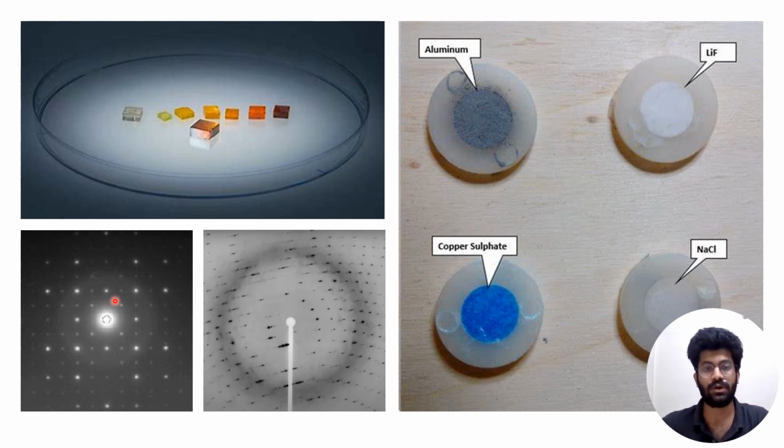The interpretation of single crystal diffraction is much less ambiguous than the powder diffraction method, but the challenge in these experiments is to prepare the single crystal samples, which can often be a highly laborious and time-consuming process. The methods of preparation for powder XRD are powder grinding, and for single crystal diffraction, thin layer depositions and growing single crystals using single crystallization techniques are used.